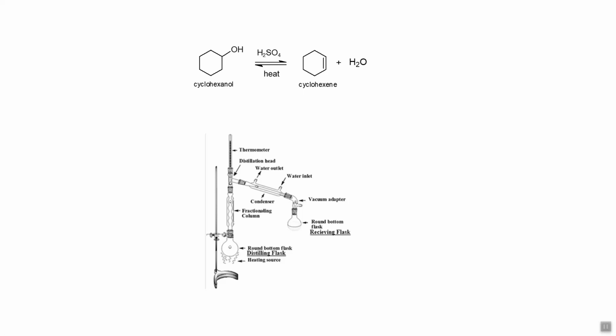Then you're going to work up this reaction mixture and isolate it using a liquid-liquid extraction. You all are experts at liquid-liquid extraction, so I have no doubt you're not going to have any problems with this step. You're going to pour this receiving flask into a separatory funnel. Again, remember that when this distillation apparatus is hot, you are not taking off this distilling flask.